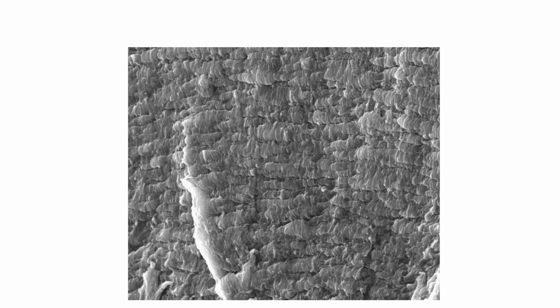Fracture shape. The transverse lines, shaped like tree rings, are observed at the surface of the fracture appearance. Cause. The part's fracture occurs due to the stress from periodic vibration and operation. Feature. It takes a long time to incur the fracture.